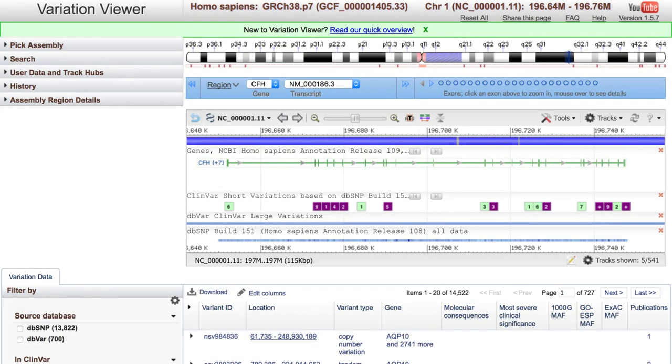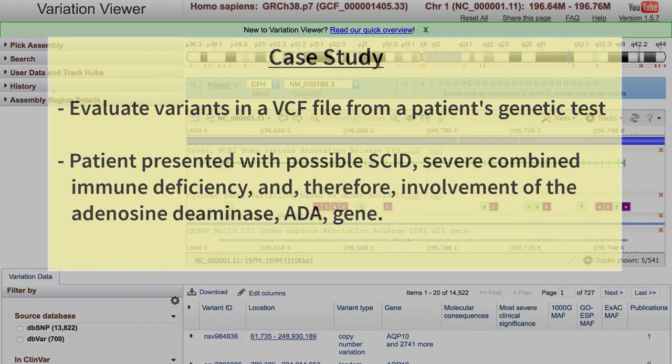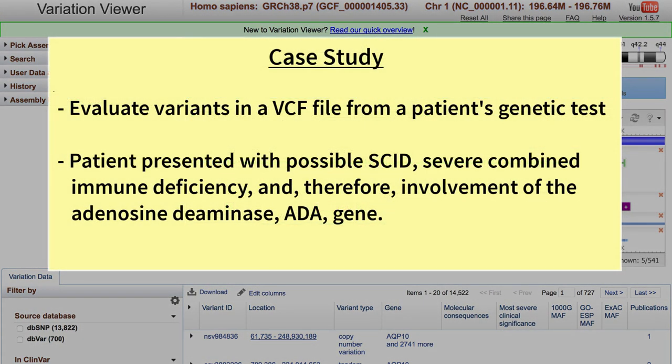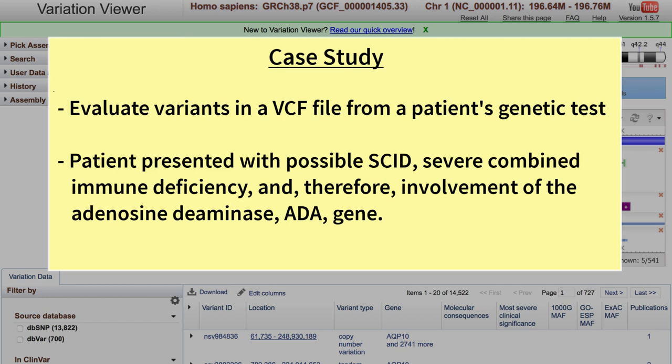This video highlights NCBI's Variation Viewer and demonstrates how a medical practitioner or researcher can use the viewer to interpret clinically relevant variants. We will evaluate and prioritize three variants in a VCF file from a fictitious patient's genetic test results. Our patient presented with a phenotype suggestive of SCID, Severe Combined Immune Deficiency, so the adenosine deaminase or ADA gene might be involved.